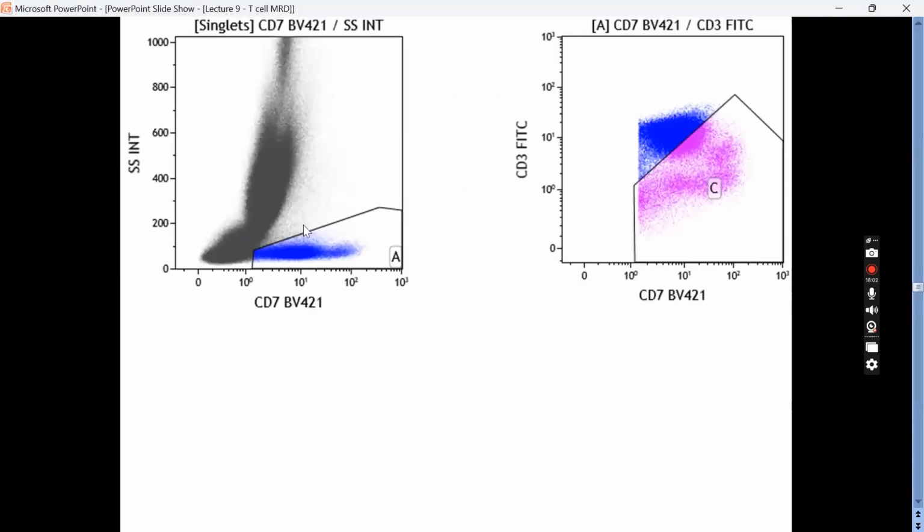Now I have shown you a tabular column showing the marker down-regulation, CD99, TDT, CD34, CD10. At pre-treatment, how many percentage of cases have shown greater than 20% expression in blast? And how many cases have shown greater than 50% expression in blast? And you can just check it with day 29. You see the percentage has markedly come down. The percentage expression of these markers in the blast has markedly come down. So that is the reason why these markers are very labile.